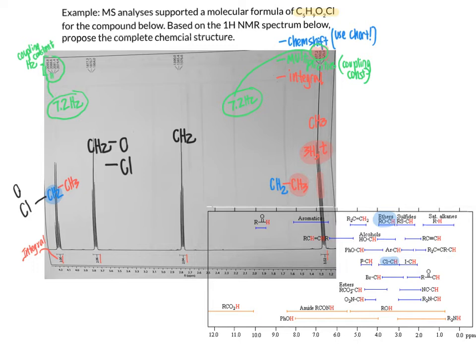And then we have our other CH2 group over here between 2.7 and 2.8. When we look between 2.7 and 2.8 in our data here, that puts us right around in here. So it's a couple of groups that have a nitrogen atom as I go up in the table. That's definitely not it since we don't have that. Possibly a carbon-hydrogen bond that's directly bonded to a carbonyl. Iodine-containing group, nope, can't be that. Aromatic, not going to be that because we don't have enough carbon atoms to make an aromatic ring and then have a carbon off of it.